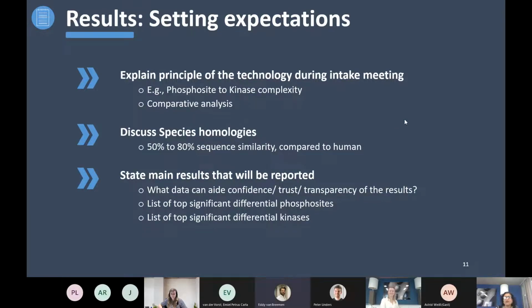Beautiful question. Yes, very good question. Indeed, that is in the pipeline for PamGene. But it's important to know that the actual sequence is what we blast for our upstream kinase or other results. So we're not really taking the UniProt IDs that are related to these sequences.